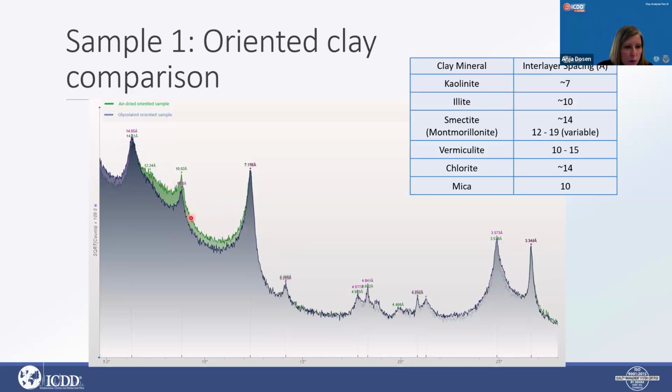If this was an interlayered peak, this peak would sort of become like a hump. It would push a little bit or move a little bit towards lower 2 theta. And that's something for you to keep in mind, that you need to have a database and you need to have examples that you can compare your data to, but you got to keep in mind, which I'm sure that you know, is that data is messy.